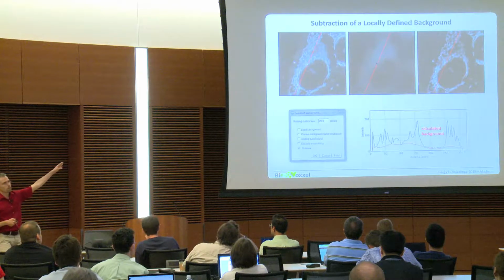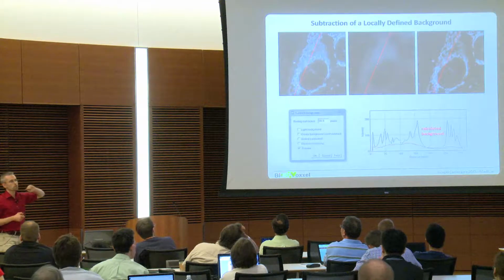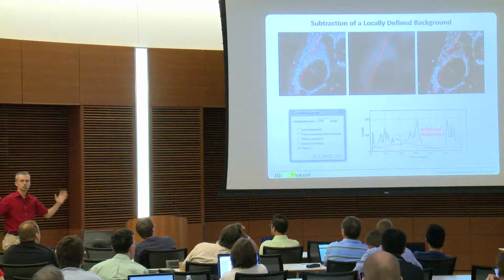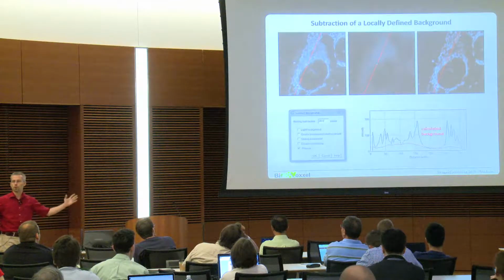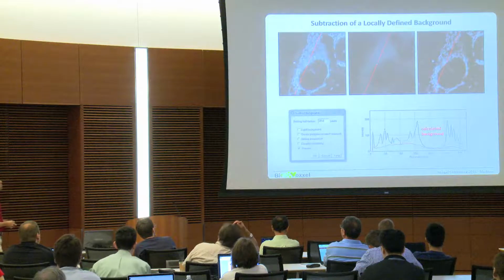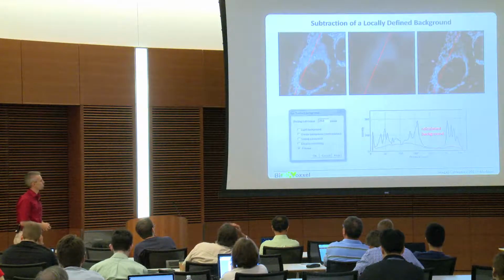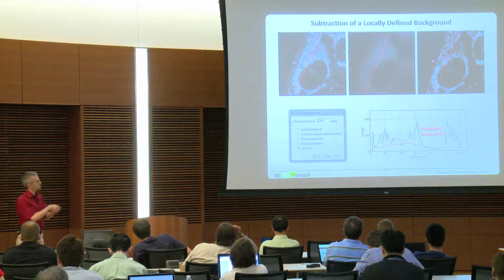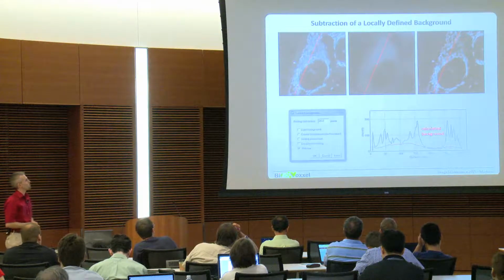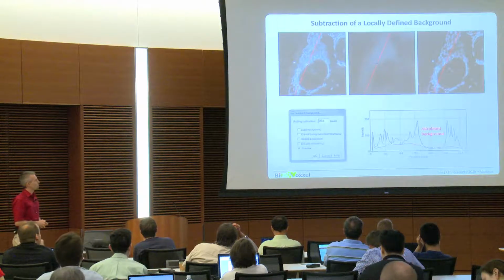For elongated things like what we have here, like stained mitochondria, it's potentially recommendable to look for the width of the objects, which is a little bit more difficult if you have variable object width, so things getting bigger and smaller. Then we would need to look for rather the bigger areas here, or clumps of those objects. But you see it nicely subtracts a variable background from the image, which makes the processing later on and potentially visualization easier or better.